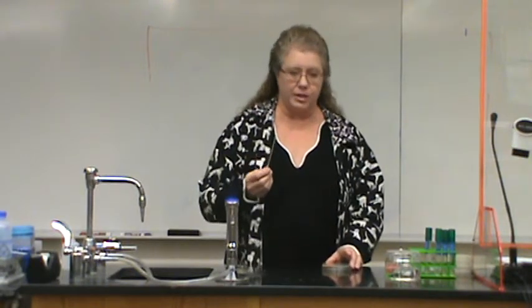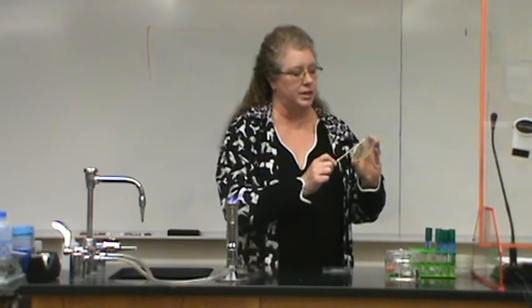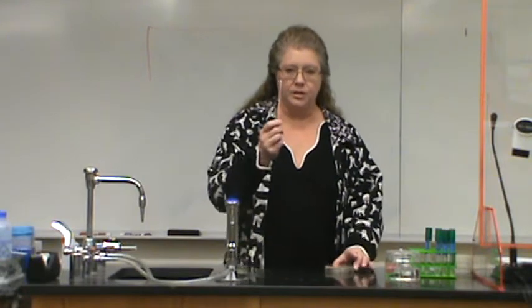Now you're going to create a lawn of bacteria, which you have done before. So you know how to do this already. But remember, lid down, pick up the plate, and go back and forth. Turn it a little bit back and forth. What you want to do is cover the whole surface of the agar without digging in. Go all the way around the rim, because you want to cover it all. You want a nice lawn. You don't want a lawn that somebody mowed that was drunk, okay? You want a really nice lawn. So we've created our lawn of bacteria. Remember, this is contaminated, so dispose of it in the appropriate place.